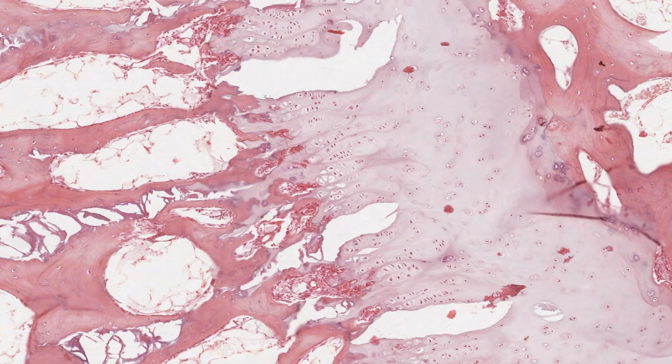Nevertheless, on the diaphyseal side, you can still see some longitudinally oriented lines of chondrocytes. Columns of calcified cartilage extend down into some of the bony spicules. There will be a thin layer of endosteum over most of the spicules and around the cavity in the diaphysis, but it's too difficult to resolve that in this image. The marrow in the spongy areas of this bone is all yellow marrow, basically fatty tissue.